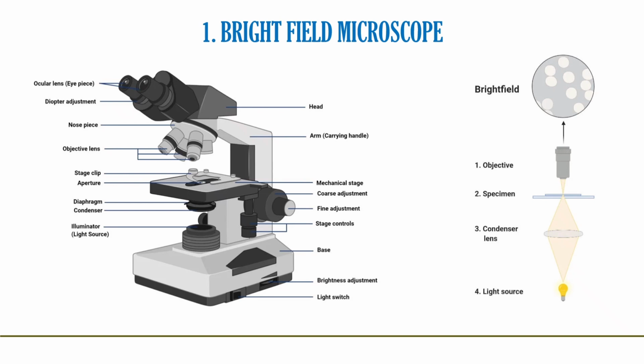It is composed of a transillumination light source, commonly a halogen lamp in the microscope stand. A halogen lamp, also known as a tungsten halogen lamp or quartz iodine lamp, is an incandescent lamp that has a small amount of a halogen, such as iodine or bromine, added. The combination of the halogen gas and the tungsten filament produces a halogen cycle chemical reaction, which redeposits evaporated tungsten back onto the filament, increasing its life and maintaining the clarity of the envelope.